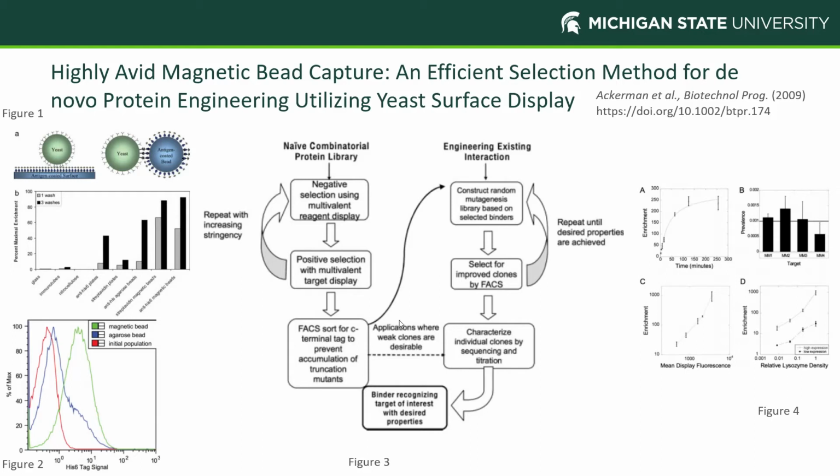These are all things that fluorescence-activated cell sorting historically struggles with, so the authors decide to look at a different way, using either an antigen-coated surface or antigen-coated beads. As we see here, the beads show a much higher enrichment ratio, so those were chosen going forward.